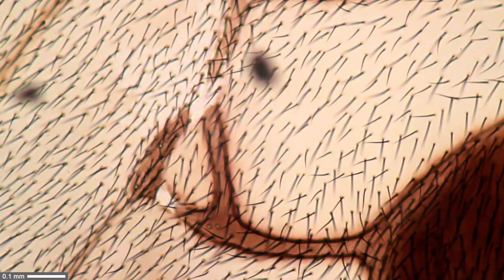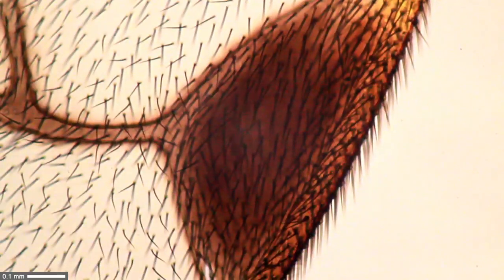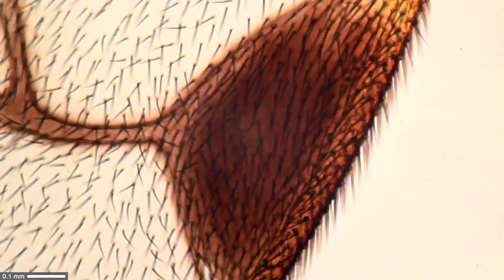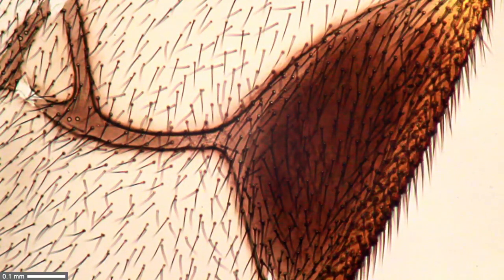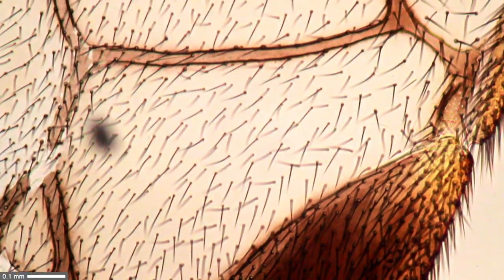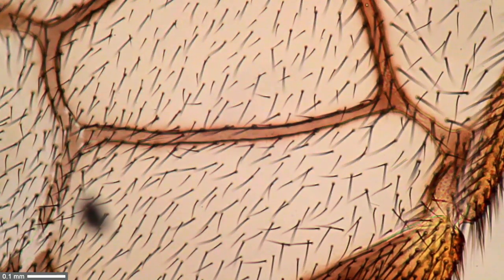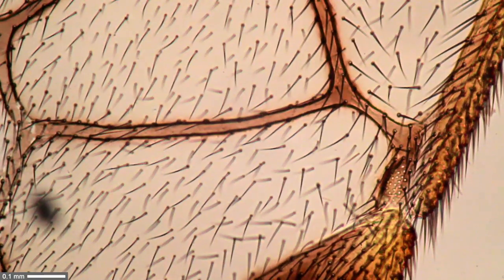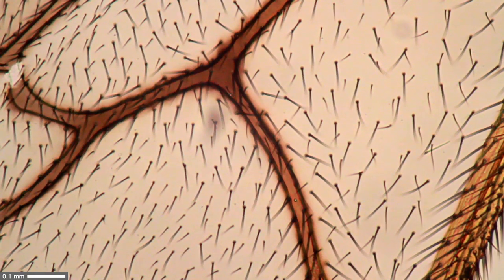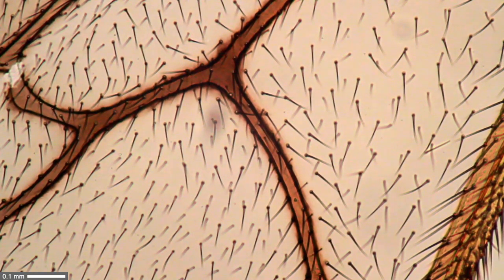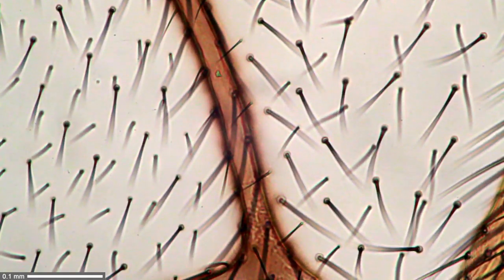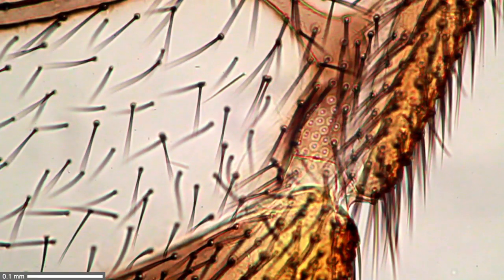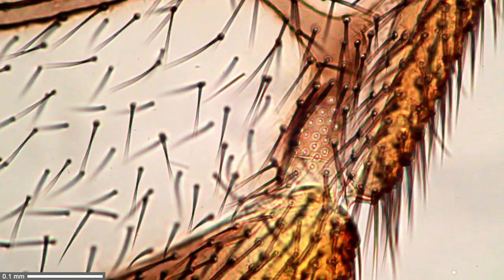Also visible, there are a large number of veins in the wing that give it strength and stability. At slightly higher magnification, we can see there are hairs on the top and bottom side of the wing. We know that because not both can be in focus at the same time, so there's a little distance between them. The veins are much darker in color, but they change color the further you go away from the root of the wing. This is the leading edge of the wing, and the hairs are quite dense here.